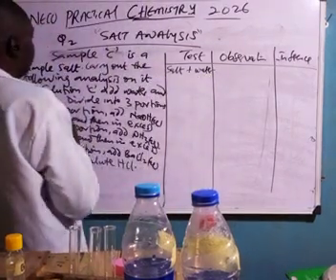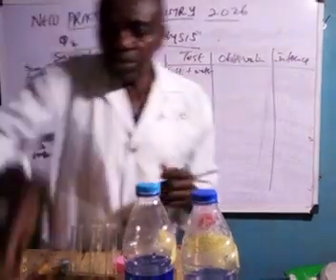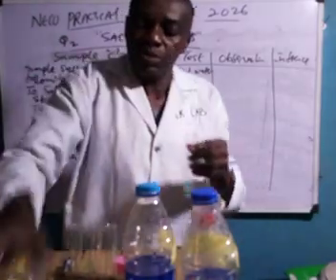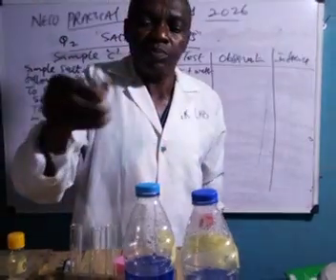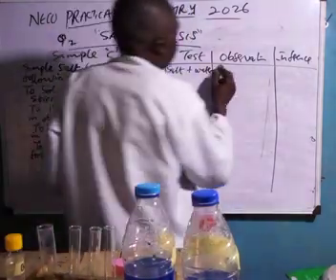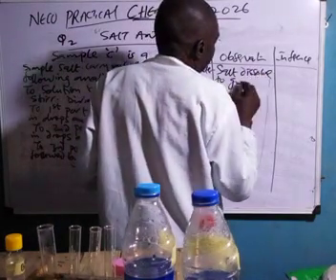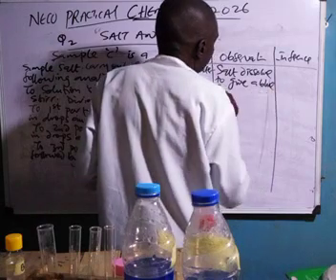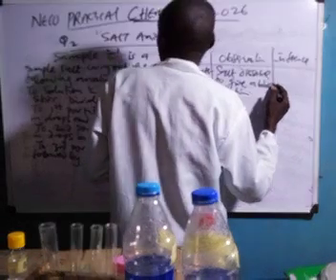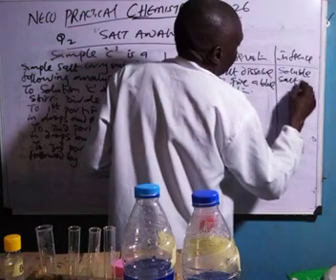Because they said add water and stir, let's see what we have. So this is my water, distilled water; tap water will do too. The salt dissolves to give a blue solution. Observation: salt dissolves to give a blue solution. Inference: soluble salt is present.